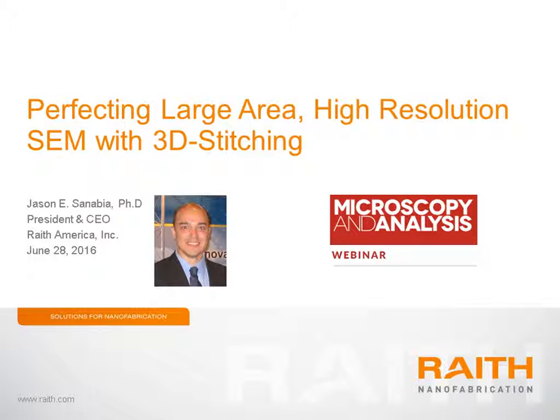I'm pleased to introduce and welcome today's presenter, Dr. Jason Sanabia, who is President and CEO at Raith America. In this webinar, Jason will describe the features of the Raith chip scanner and its applications in semiconductor reverse engineering, material science, and life sciences.